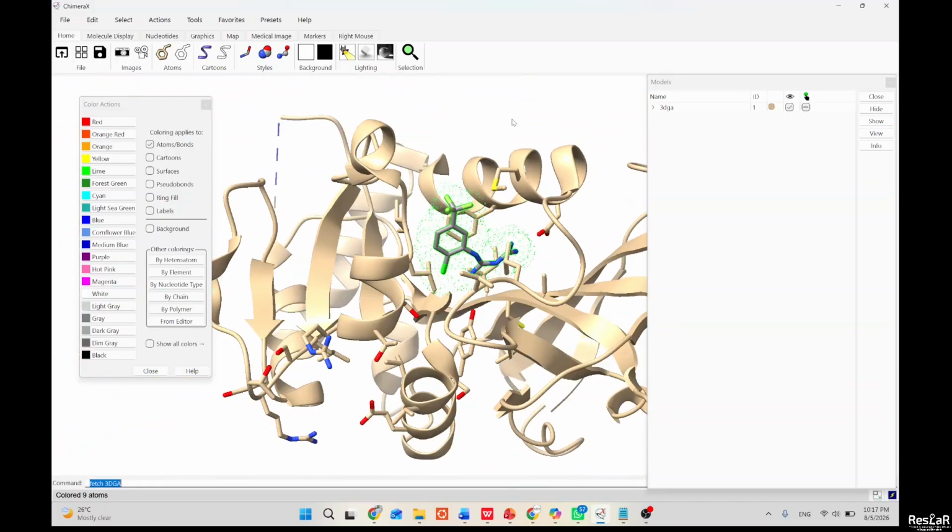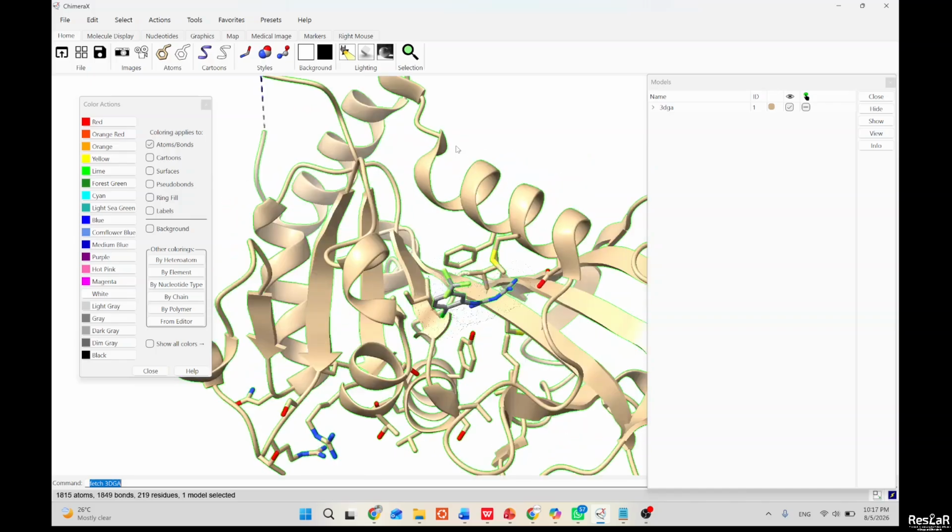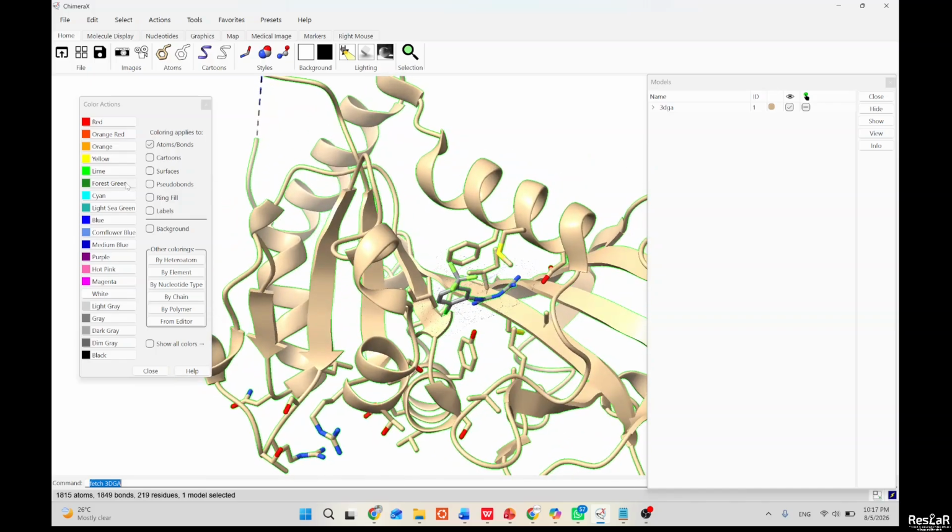Yes. So let's deal with this whole protein now, right? So we can hold your control down, click on any part of the protein, then up arrow, select virtually every other thing in the protein. Okay, and then we can decide to change the color now because the protein is a cartoon. We want to select cartoon here and then change the color of the protein.